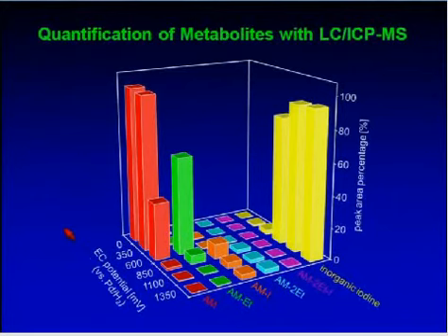If we look at this in another display, then you can see here the different compounds: the parent compound, deethylated, deiodinated, bis-deethylated, and deiodinated, and the inorganic iodine compounds at different potentials. You can see that at the lowest potential, the amiodarone is completely unchanged. But if you go to higher potentials, then you come to the formation of deethylation products first, and then later mainly to the inorganic species, which is the same thing which I showed you before, but just another form of display because it's a bit more obvious over here.